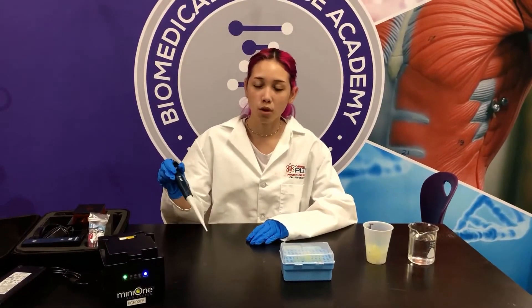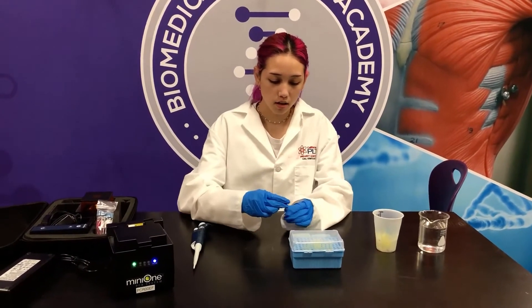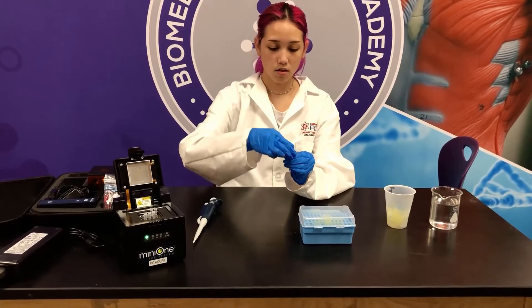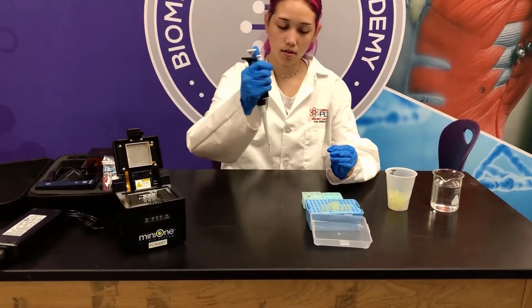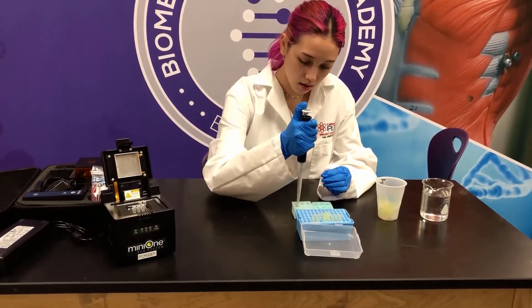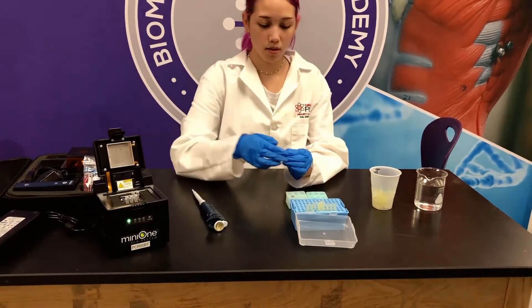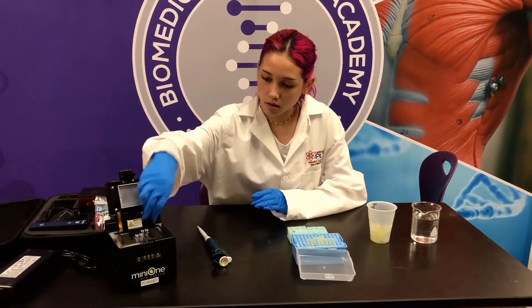I've set my micropipette to 4 microliters. Now I'm going to open the loading dye and put it back. I'm going to open a PCR tube, get a tip, get some of the loading dye and put it into tube one. Get rid of the tip, close tube one, and put it aside. I'm going to do it to the rest of them.